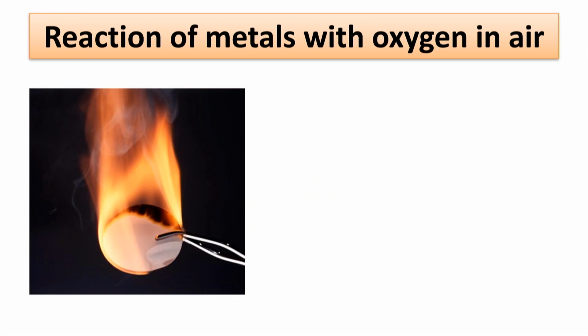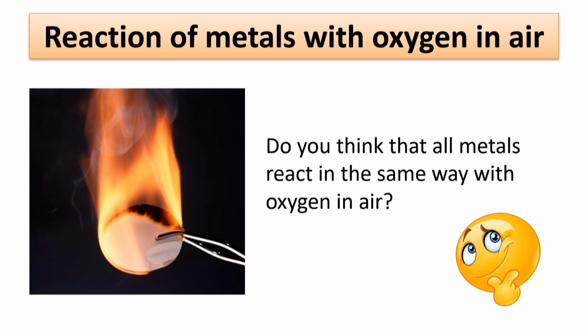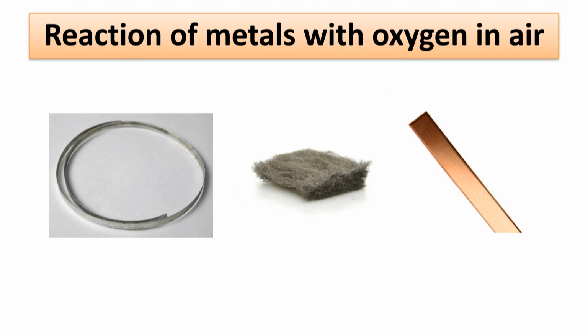We will now discover how different metals react with oxygen present in air. If we burn a metal, it will react with oxygen found in air. Do you think that all metals react in the same way with oxygen in air? Let's find out. Observe these three metals. This is a piece of magnesium. This is iron wool. And this is a piece of copper. We are going to observe how they react with oxygen. We will compare their reactivity.